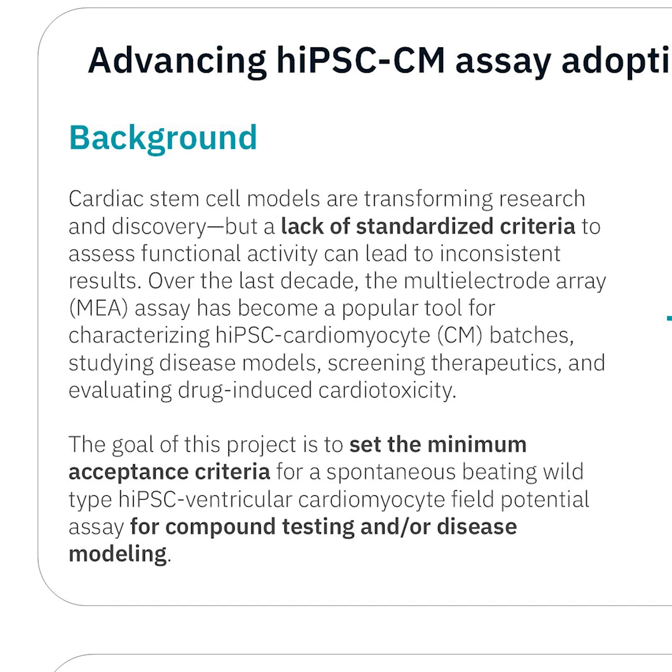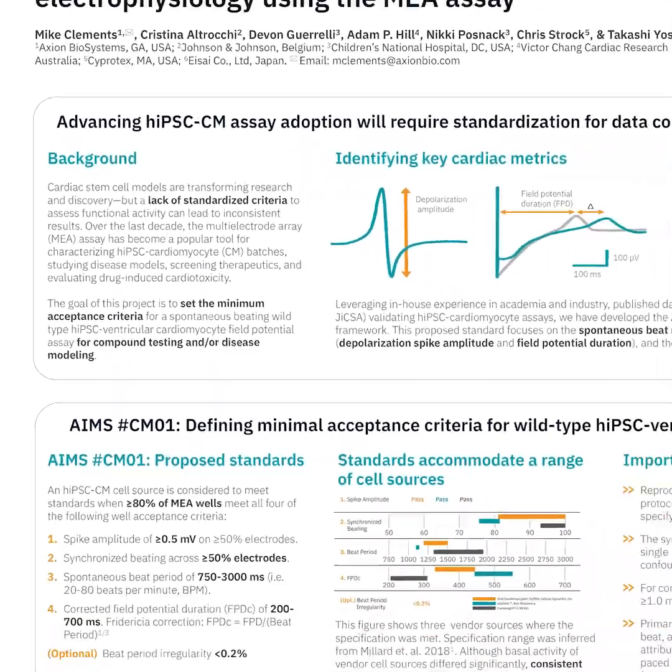The goal of this project is to set the minimum acceptance criteria for a spontaneous beating wild-type iPSC ventricular cardiomyocyte field potential assay for compound testing and/or disease modeling.